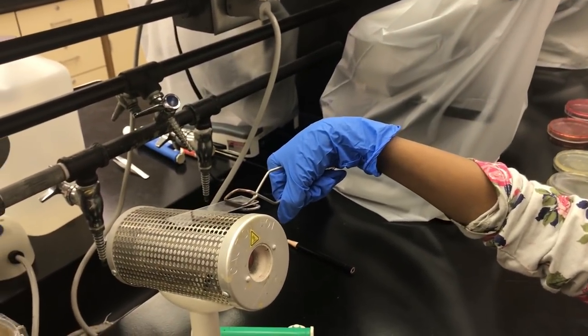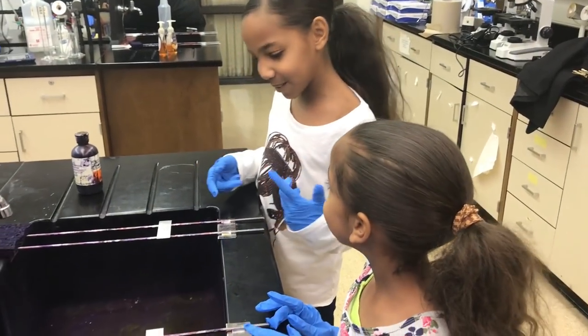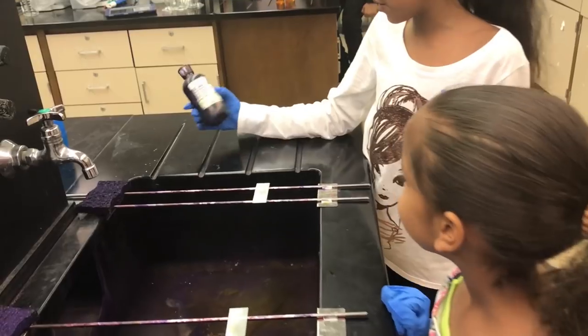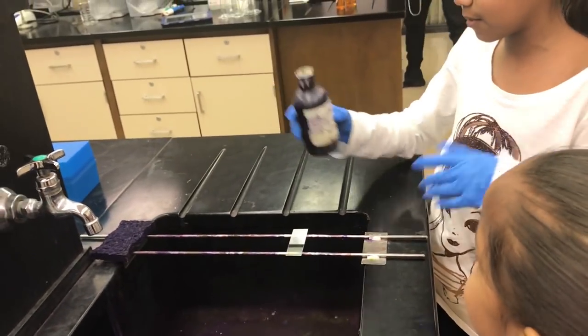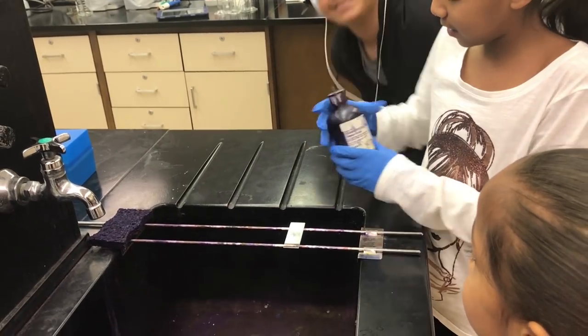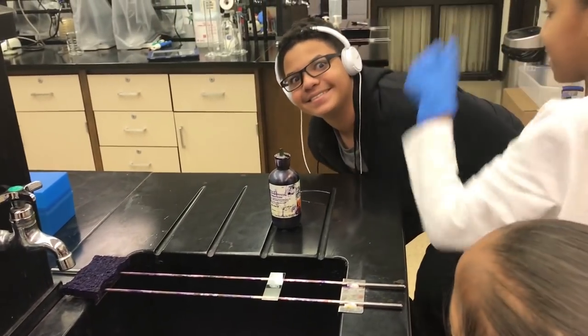Okay, we made our bacterial smears. Now we're about to do the Gram stain. We're going to be using crystal violet. Make sure you don't get it on your clothes, because if that gets on your clothes, that is it. Roll up my sleeve.